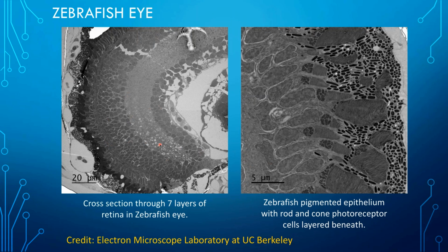And so for things like the zebrafish, where you might want to track multi-organ systems across an entire animal, it becomes really feasible to do that quickly and without having to expend a lot of data and acquisition time. And again, you don't have to go to super high magnification to still get nice cellular detail.